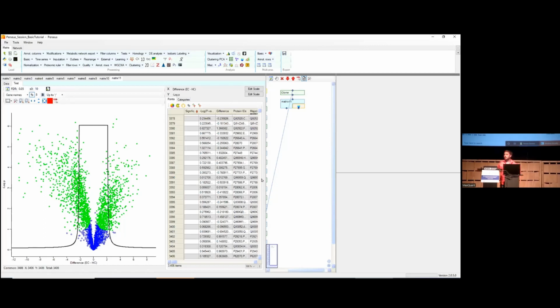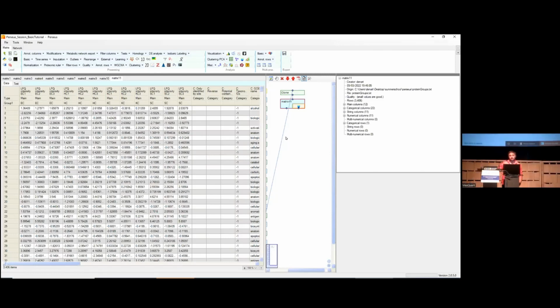Okay, then maybe last question. Other questions? Yes. So now that we saw how to do a t-test for 2 samples, the next obvious step is to run a t-test for multiple samples.